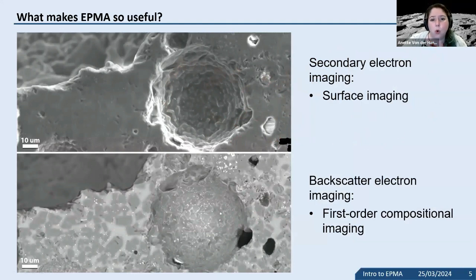Usually it has more applications in the material sciences for failure analysis. I will talk in the second talk of today about sample prep, but in general, for quantitative analysis we like flat polished samples. But if any kind of 3D interpretation is needed, secondary electrons are your tool of choice.